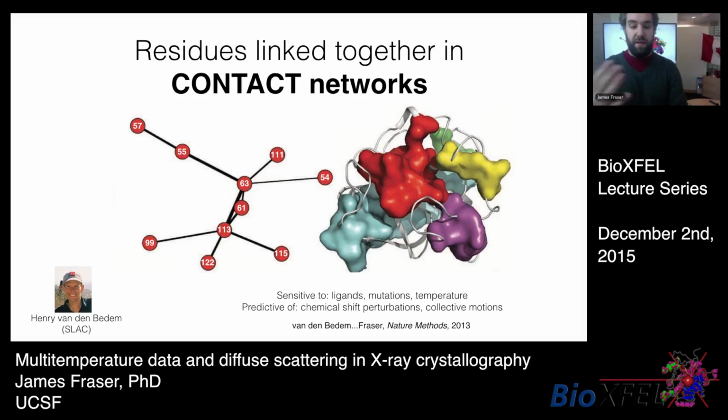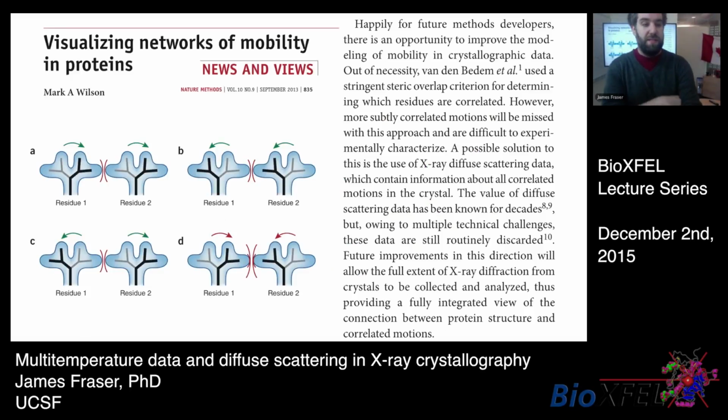And this brings me to the final point of the talk, which is that Mark Wilson, who's at Nebraska, wrote a really nice News and Views about that paper, discussing how these kinds of software are really valuable for figuring out which motions are correlated, but highlighting that there is the potential for the X-ray experiment to directly reveal these types of correlations.